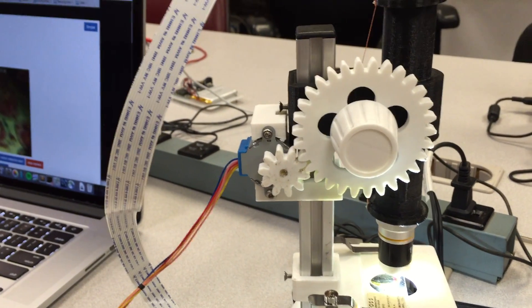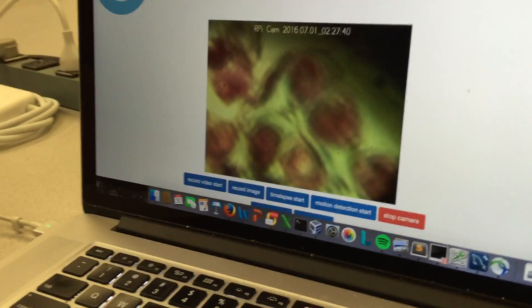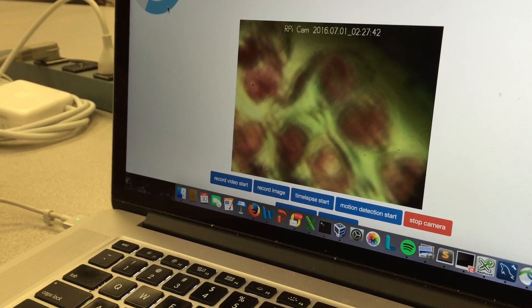We'll get a course focus going. Yeah. And what I kind of see us doing is pretty out of focus. So we've got a ways to go back.